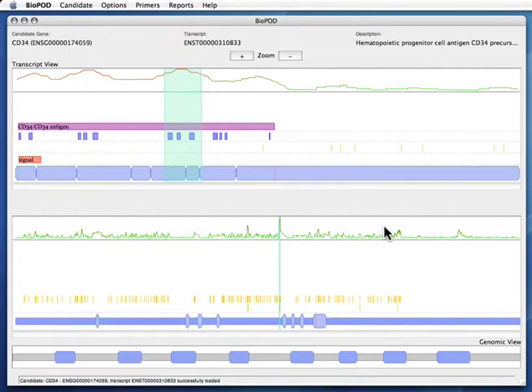This is the output of our unique search algorithm called PAR, which implicates regions of high interest when searching for disease-causing mutations. A higher point in the graph suggests that region to be more important in your mutation search. The highest point is conveniently highlighted by a green bar. You could verbally translate this algorithm as saying, start your search for mutations in this exon. Likewise, you would also start at the green PAR region of your other candidate genes.